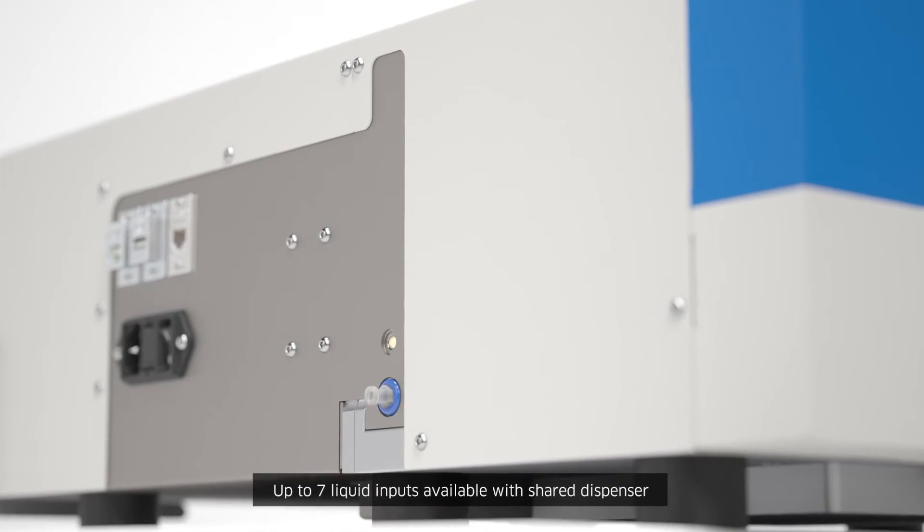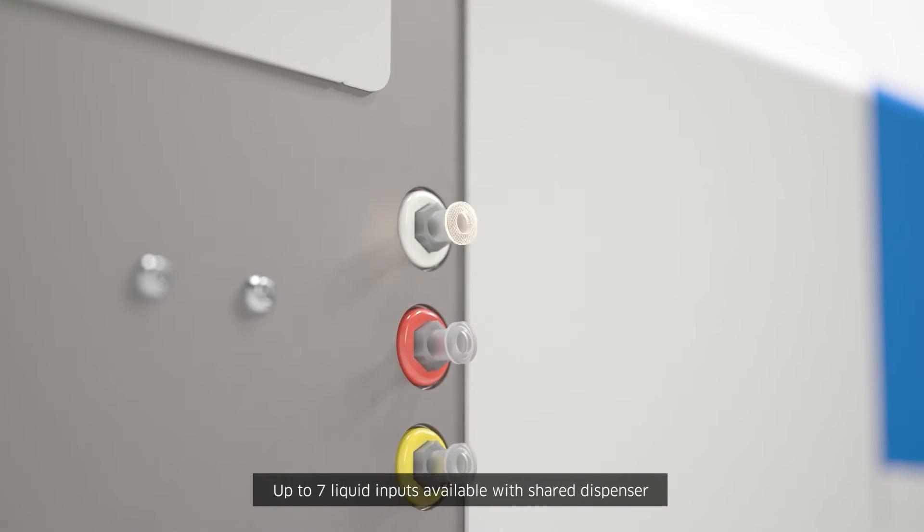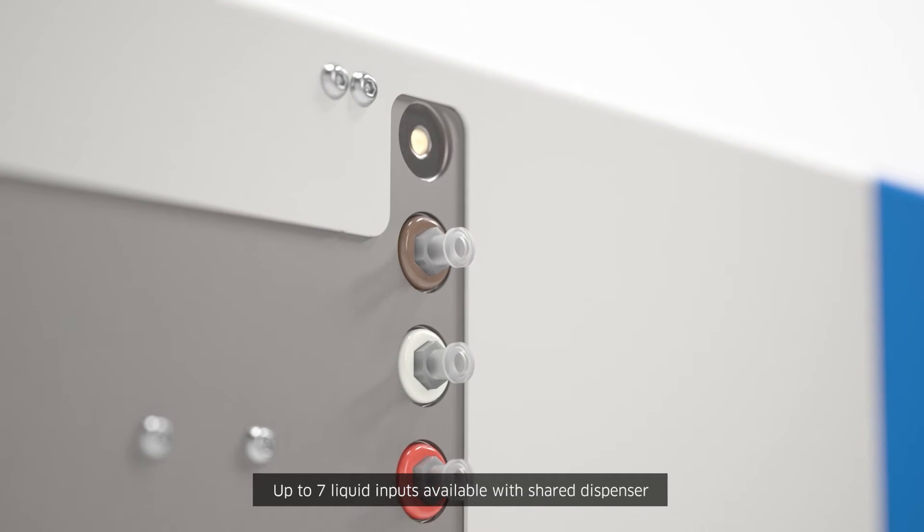In the standard configuration of Blue Washer, up to seven liquid inputs can be used to dispense via a shared internal liquid path and dispense head.